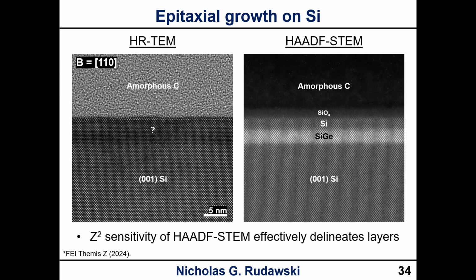Excellent. Next question is from Timothy Pishkov. Do we need to do anything specific in STEM to get high-resolution images for thicker samples? I always thought that only TEM could get something decent if the sample is greater than 100 nanometers. Is it just the orientation of zone axis?